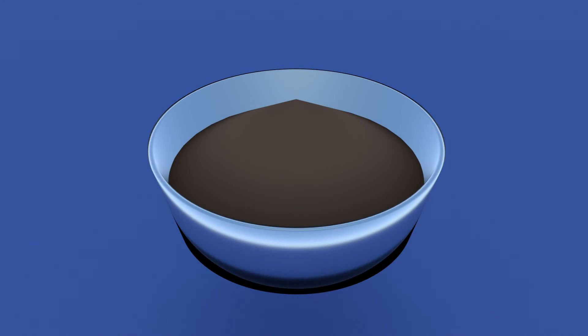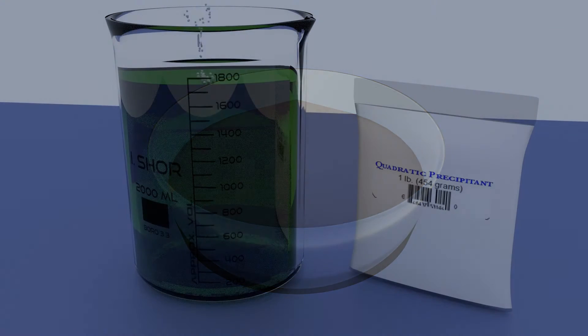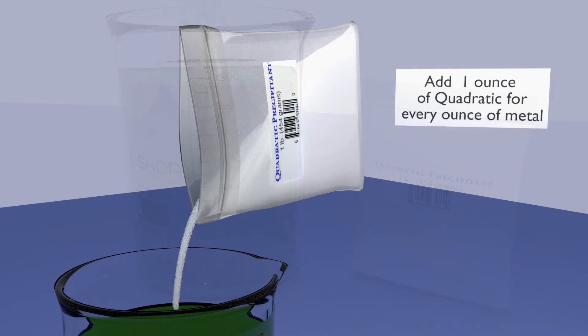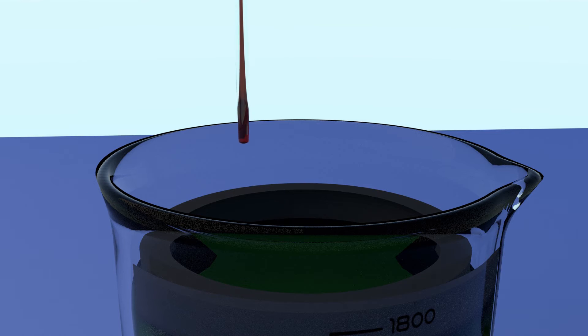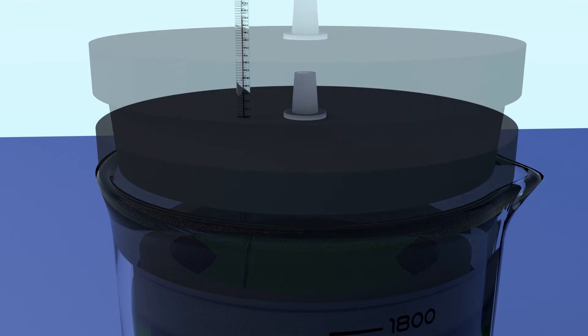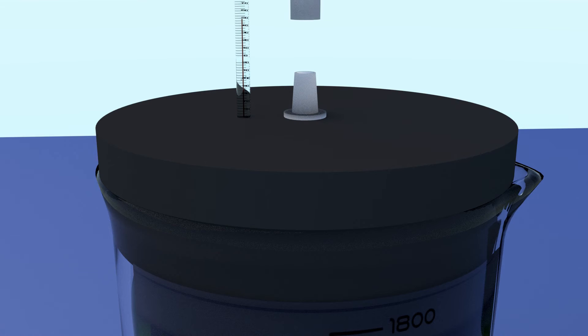We are ready now to convert the dissolved gold into gold particles. Add 1 ounce of quadratic for every ounce of dissolved metal. Replace the cap and bring the beaker back inside, reconnecting it to the scrubber.